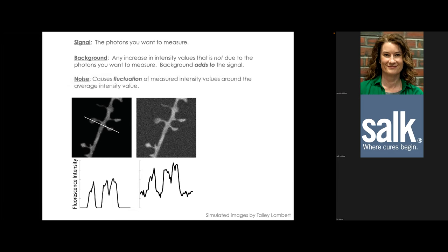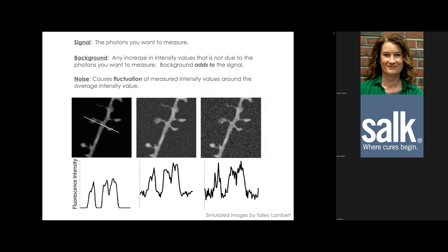Noise is different from background — it's a fluctuation in intensity values across pixels. You cannot subtract noise the way you can subtract background, because noise is a variance, not a constant offset. When noise is added to a simulated image, we see greater fluctuation in intensity values across the line scan.